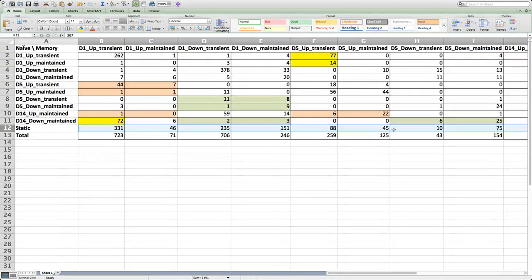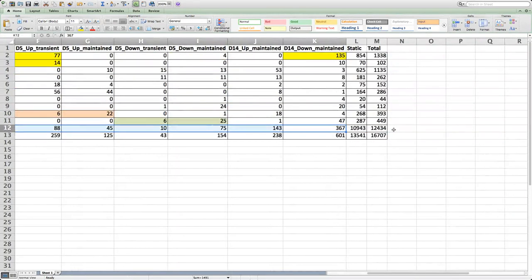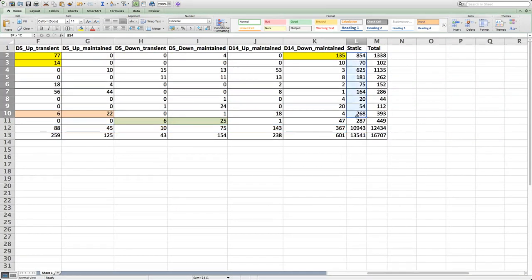And is it a larger group in naive or memory? If you look in the lower right, I believe it's a larger group in naive, because these are the ones that are changing in naive but not changing in memory. Yeah, but actually that's bigger, because it's 13,000 minus 10,000, right? Yeah, 13.5. Actually, it's pretty close, because it's this number versus that number. Right, but that one is bigger. Well, it's 13.5K versus 12.5K. Okay. It's not a huge difference. I wouldn't generally consider that a substantial difference.